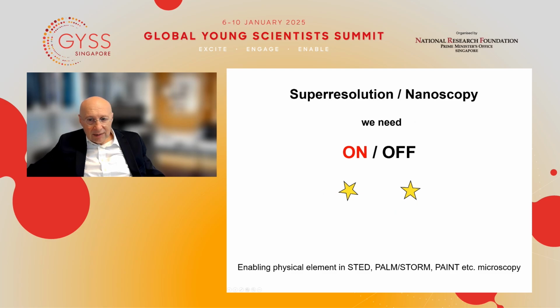This is very recent. It just came up basically experimentally this year. As I said, for separating all these methods, STED, PALM, STORM, the ones that got the Nobel Prize, all rely on this on-off principle, turn molecules on-off sequentially.